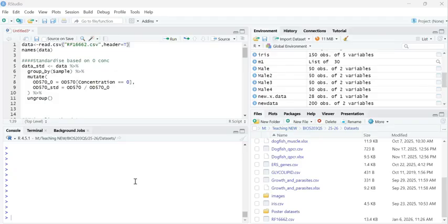So the data set is an example data set, and it contains optical density readings for an MTT assay performed on cells following exposure to microplastics. So let's have a look. So we've got our data set, and quite a lot of this first initial bit will be familiar to you, and then it will get a bit more in depth. Don't be frightened by it. I will highlight which bits you need to change based on what your data set may say.